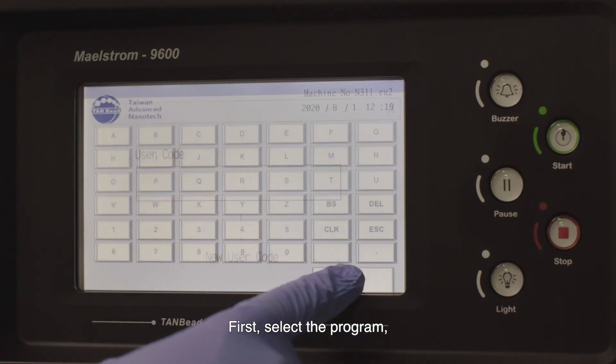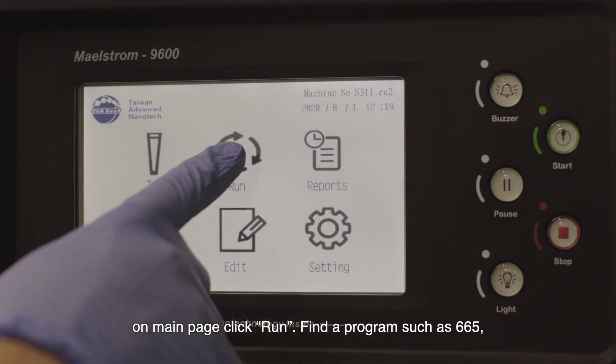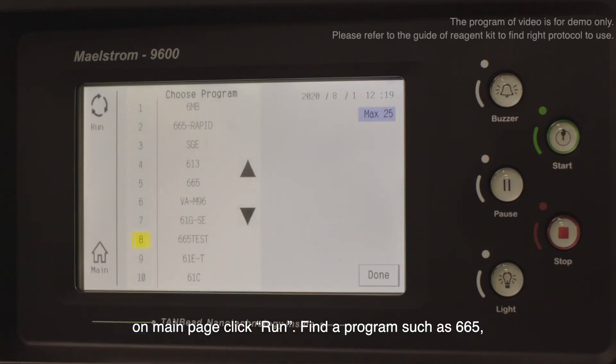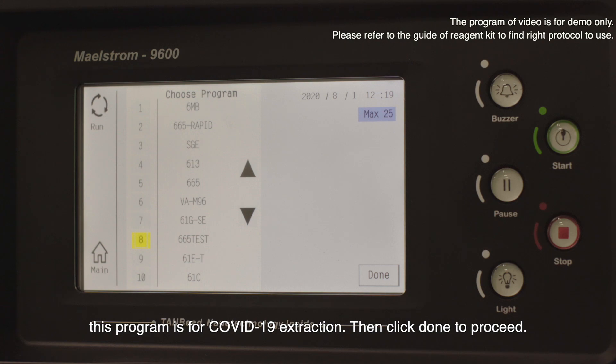First, select a program. On the main page, click run. Find a program such as 665. This program is for COVID-19 extraction. Then click done to proceed.